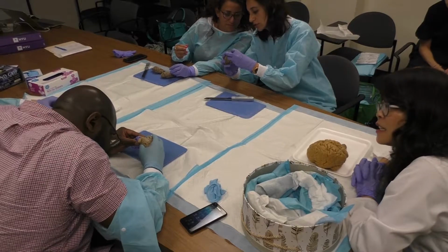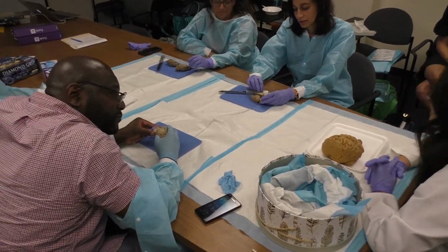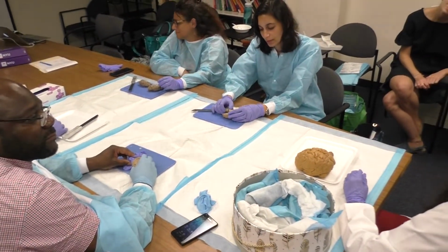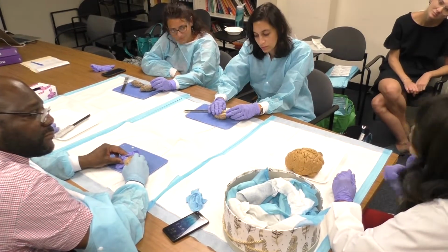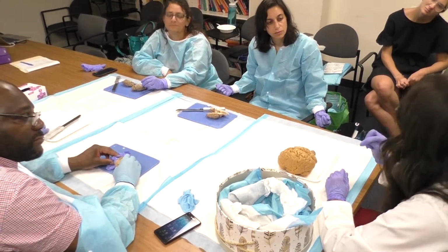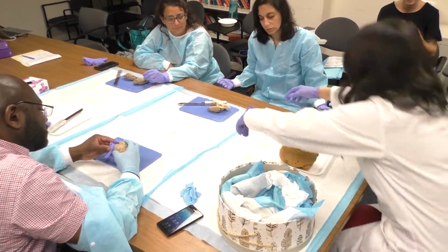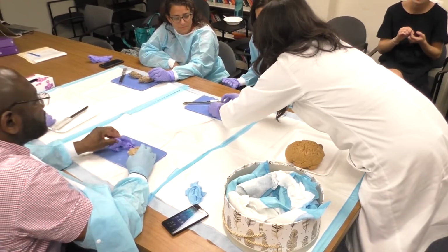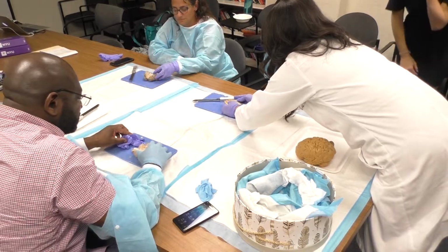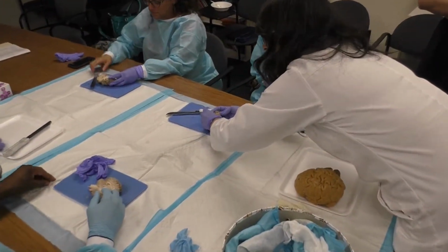And the inferior colliculus, the smaller one, has to do with auditory processing. You probably won't get into that in your groups, but if you follow the auditory pathway from sound going into your ear, up to primary auditory cortex, it passes through the inferior colliculus as one of its processing pathways. You might want to take pictures of this colliculus side view and then have somebody pull it open so you can see what it looks like in here.